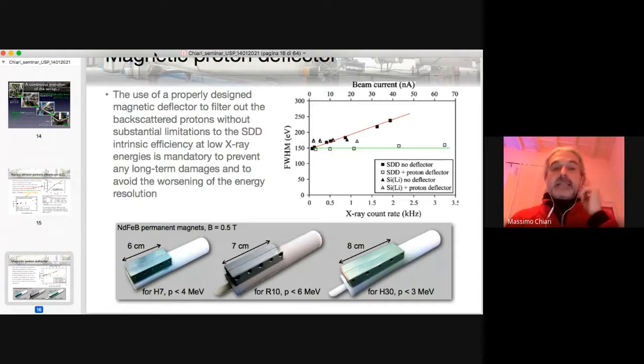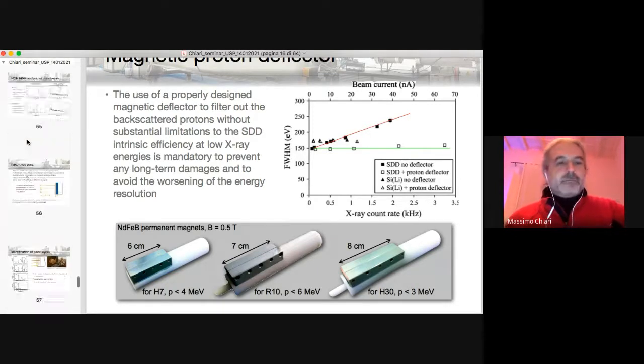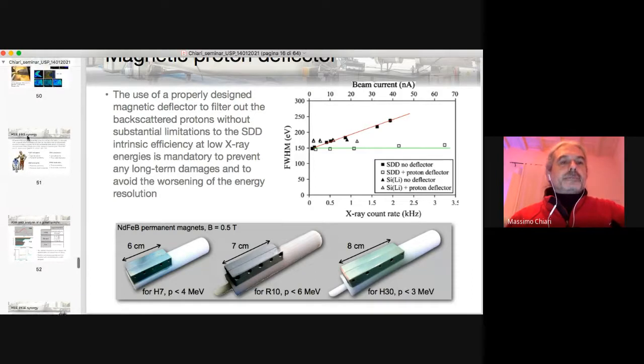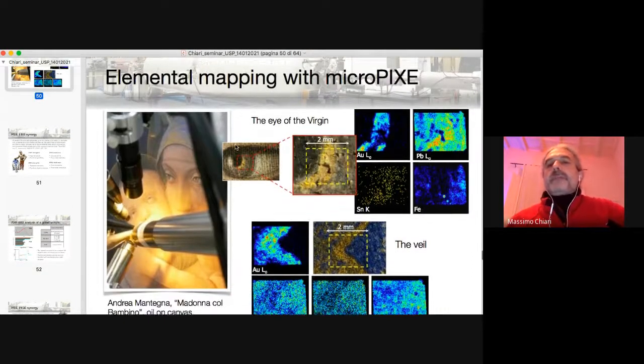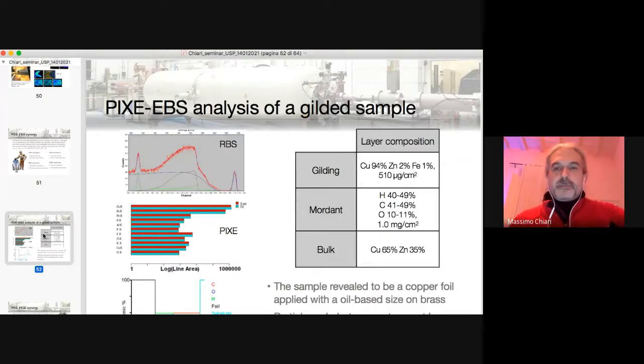But nevertheless, in some cases, it is important to achieve also a quantitative analysis. That can be done, for example, by IBA more than the XRF, because it's more complicated. And the examples that I've shown to you are not the only ones. For example, in this elemental mapping, this is just qualitative information. Where is gold? Is it associated with other elements? Okay, just enough.